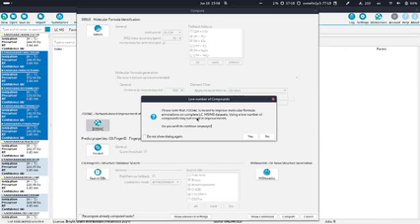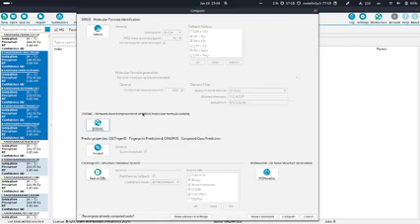So in principle, you can think of it like it's doing some kind of molecular networking and then tries to annotate networks in a way that they are consistent to each other. So it's a re-ranking method which only makes sense if you apply it on the complete data set. It doesn't make sense to do that for 5 compounds or something. So you would run it on a complete LCMS run with, let's say, 1,000 compounds or something, and then it will improve the ranking significantly. So we had this warning. Let's just click no for now and explain everything in order. So all the tools. Question?